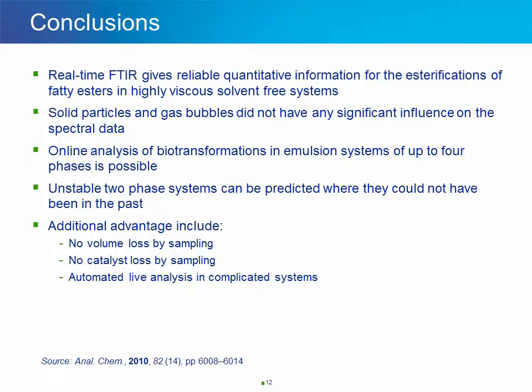That neither the solid particles nor the gas bubbles had any significant influence on the spectral data. That the online analysis of biotransformations in emulsion systems consisting of up to 4 phases is possible, making unstable 2-phase systems accessible for analytics which could not have been displayed appropriately before.